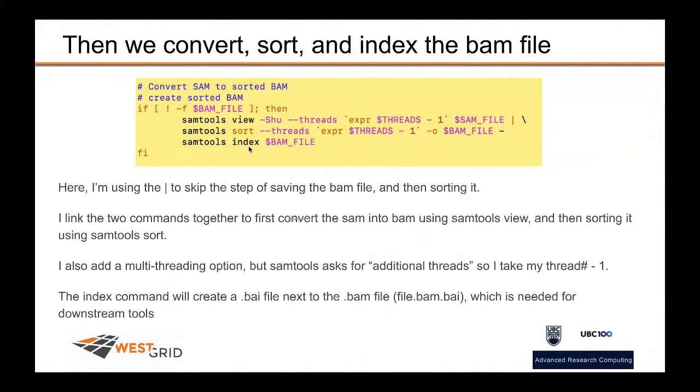Lastly, I'm going to index that BAM file, and this is going to be necessary for visualization later. So we'll produce a .bam.bai file next to the BAM file, which is needed for these downstream tools.